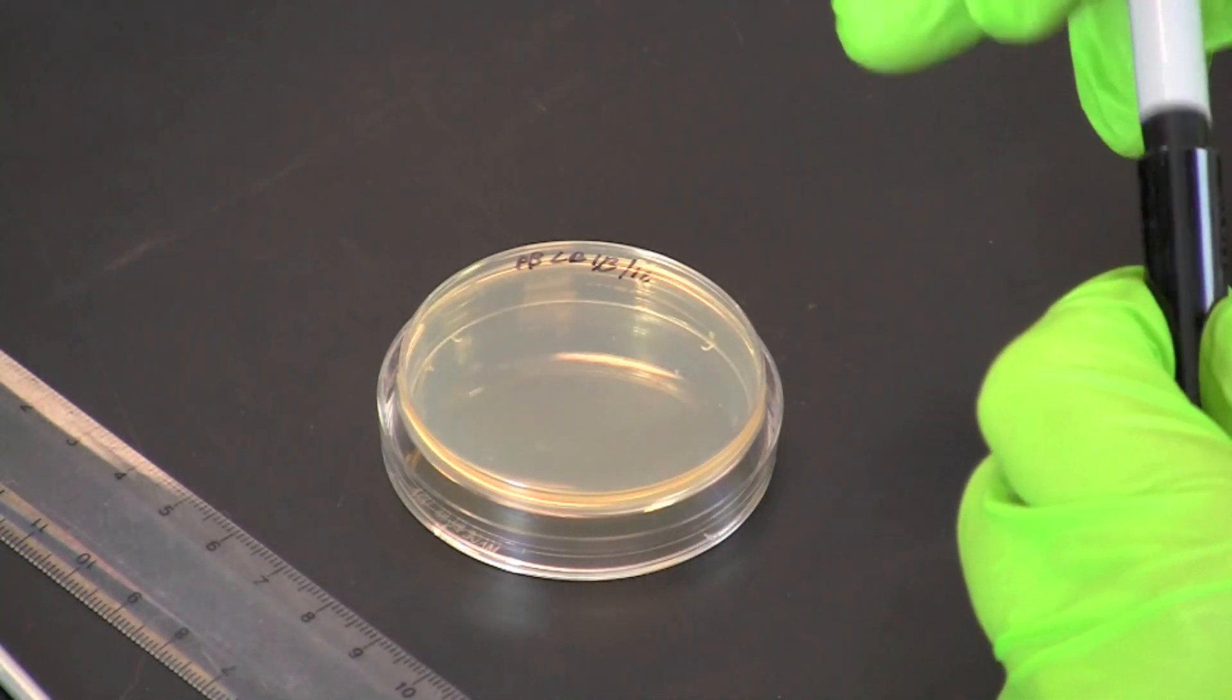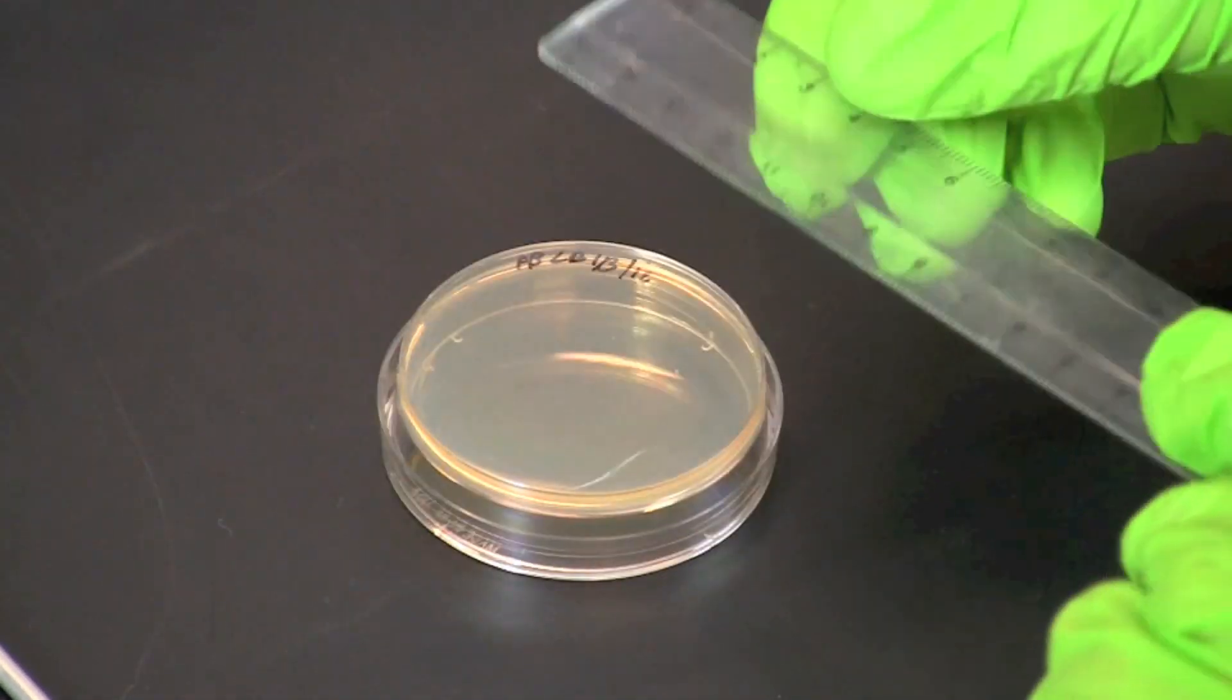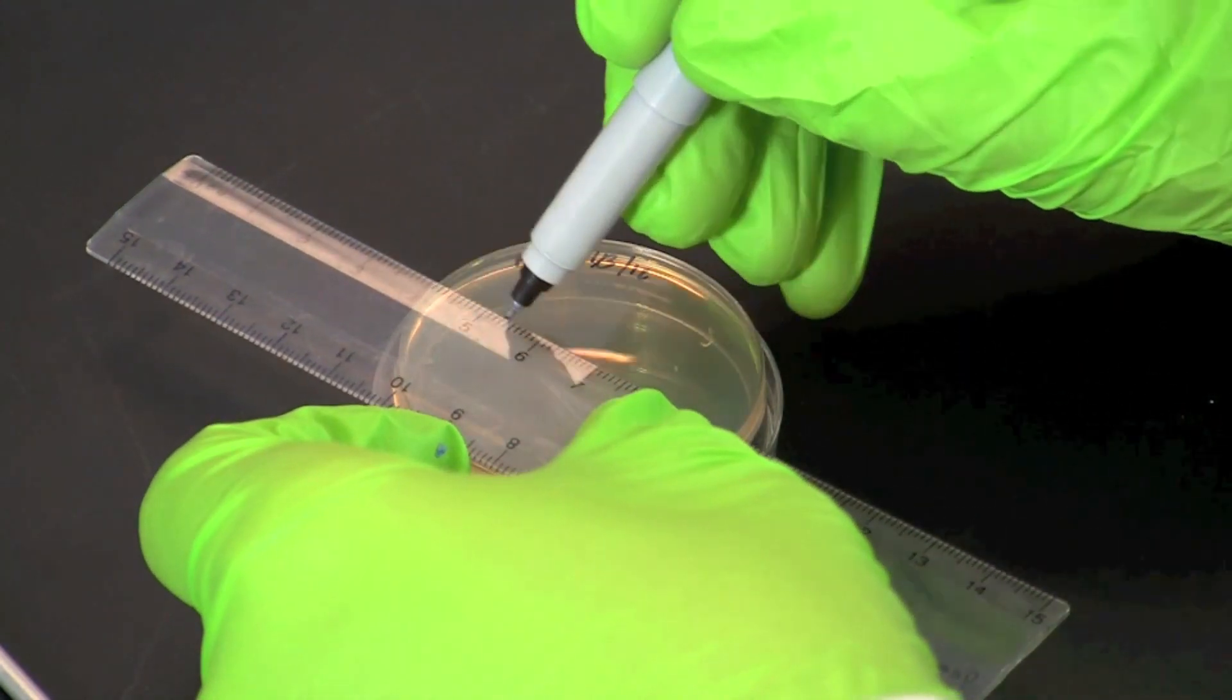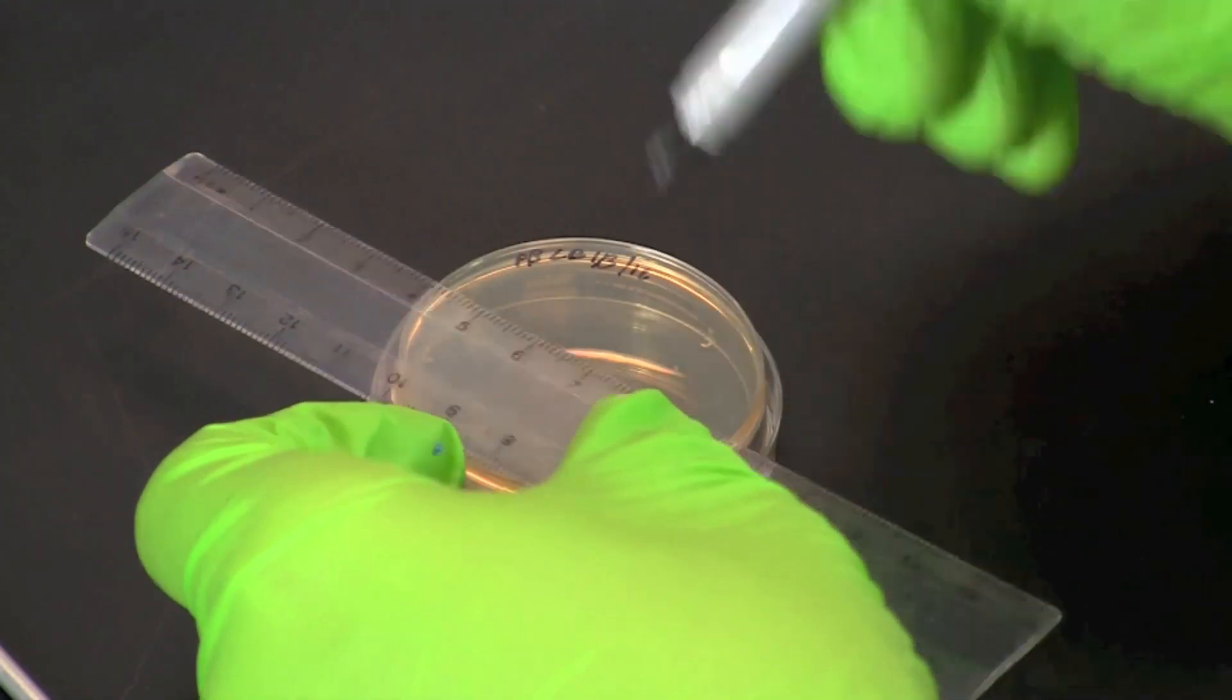Using a laboratory marking pen, divide the bottom of an LB agar plate into four quadrants by drawing two perpendicular lines that form a large X.